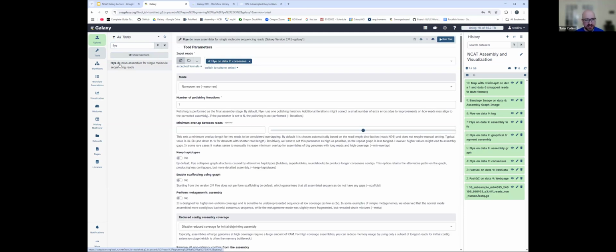There's several metagenomic assemblers that often get used: metaMDBG, metaSPAdes, Flye in metagenomic assembly mode. For this case, we'll use Flye. metaMDBG is currently not on Galaxy, but is being wrapped and added into it. It was just pending a couple problems that were showing up, but we'll walk through here how to do it. And then we'll go through our data, and then we're going to show off some visualizations to really look at how our assemblies came out from when we ran this.